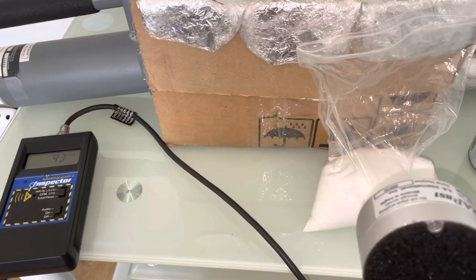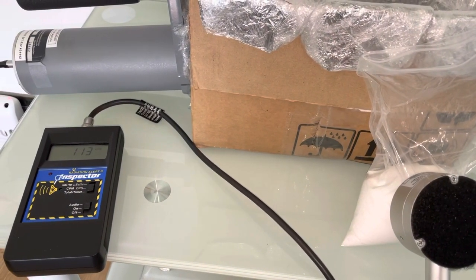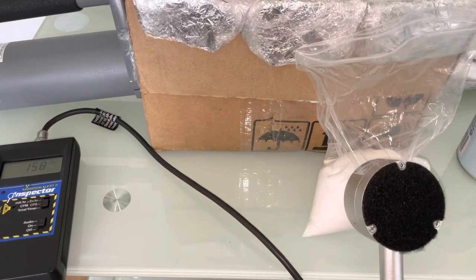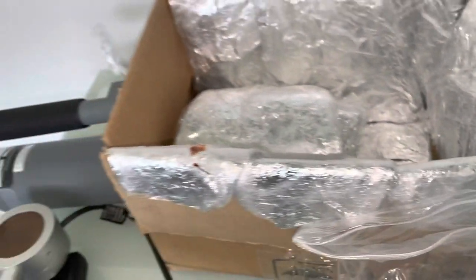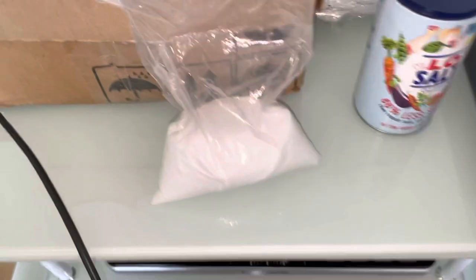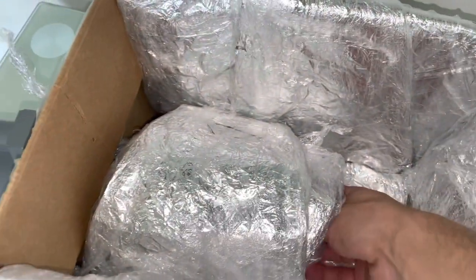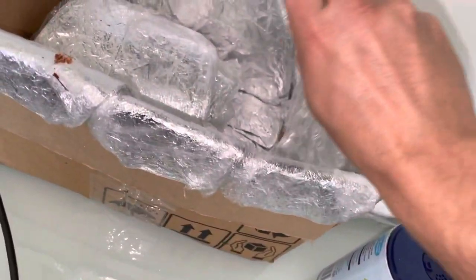So here is the salt — nothing changed. We're going to connect it to the gamma spectrometer. That's the detector inside the lead. We got some more lead, even more lead.